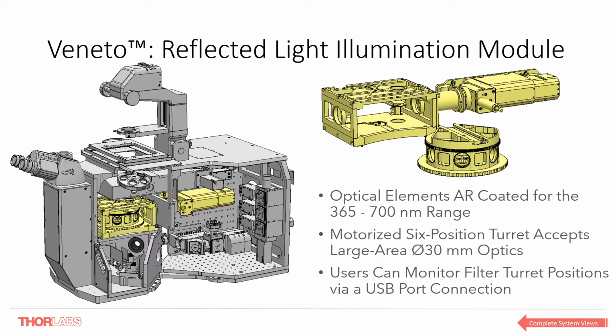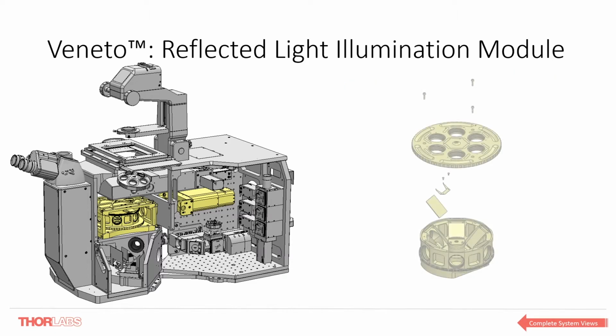The fluorescent turret is fully motorized and contains spaces for 6 sets of excitation and emission filters. The design of the turret is such that once slid out from the microscope, the filters are easily accessed by removing the cover. The dichroics are held using small springs so as to assure that the mounting does not produce any mechanical stress on the optical elements.